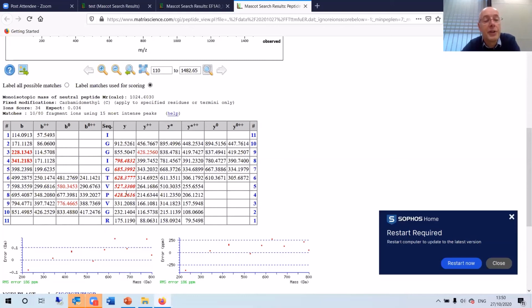Okay, that's interesting. I would accept 7 consecutive amino acid residues for a hit. Here we only have 6. However, the last one is proline, and very often the sequence run is broken after a proline residue. So looking at the mass errors, which are acceptable, I would probably say that this is real.